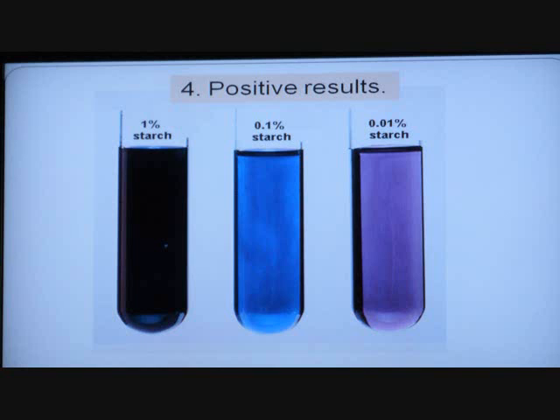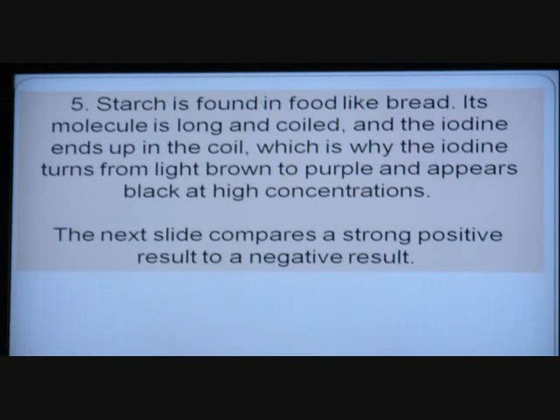Now the next one I'll show you. I brought in some bread. I brought in honey wheat bread. I didn't bring any regular white bread in, which is the worst kind to eat. But the starch is real long and coiled up like a spring. And that's why it's the curl that bends the light and makes you see the color you see when the iodine reacts.